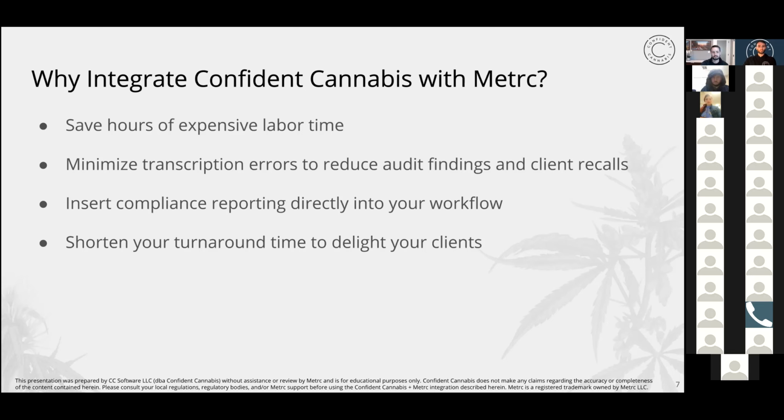Very importantly, it shortens your turnaround time, which really makes your customers happy. In this really competitive environment, clients really want to get their lab results as fast as possible so they can sell that inventory. Every day that they don't have the passing test results is a day they're not generating revenue. So turnaround time is a huge competitive advantage for labs who can operate efficiently.